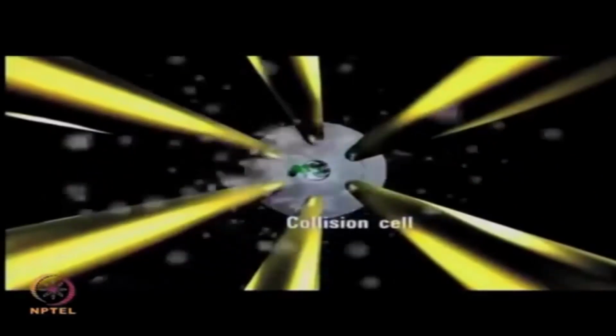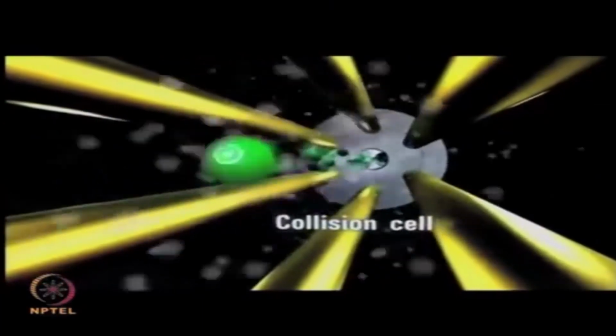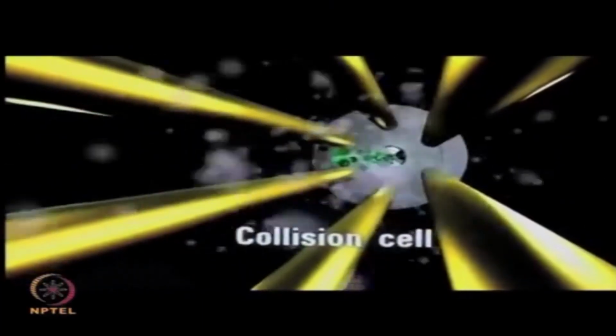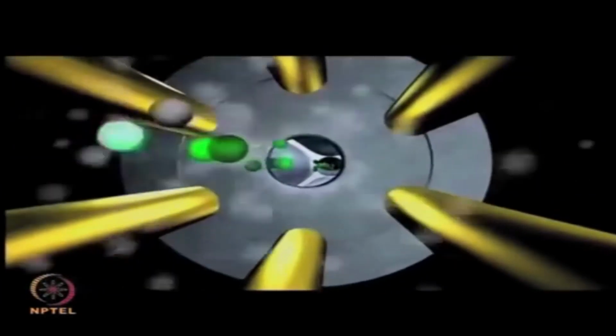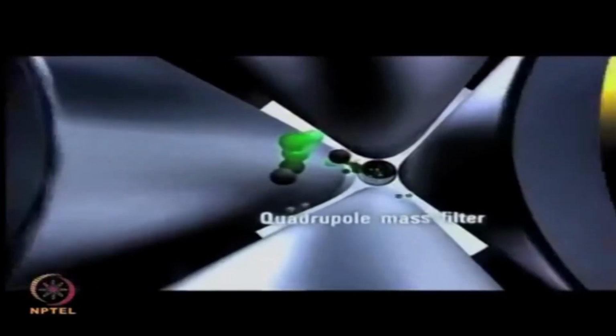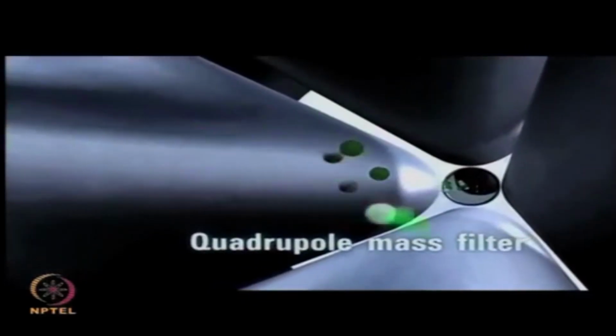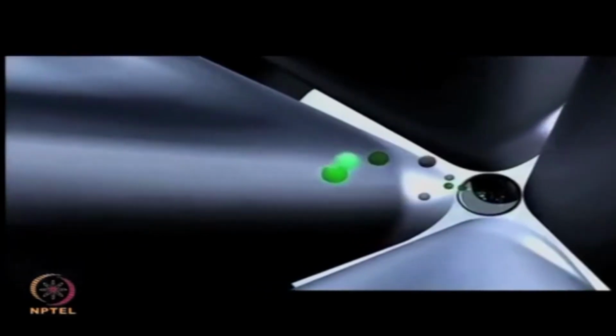In the hexapole collision cell, precursor ions strike collision gas molecules, generating product ions and neutral fragments. Linear axial acceleration and high collision gas pressure simplify operation and ensure fast, sensitive MS-MS without cross-experiment memory effects. The second quadrupole serves as a mass filter for the product ions produced in the collision cell. For quantitative analysis of a target compound, the second mass filter is operated in a selected ion monitoring mode.